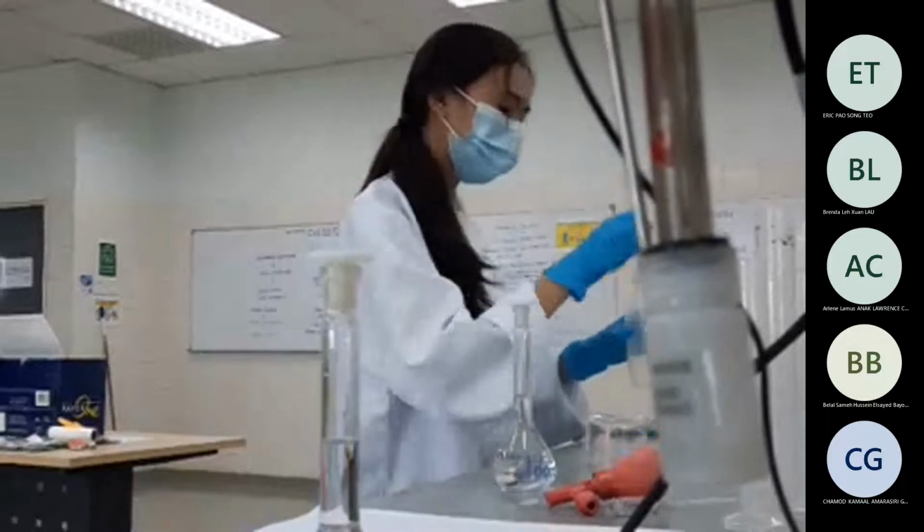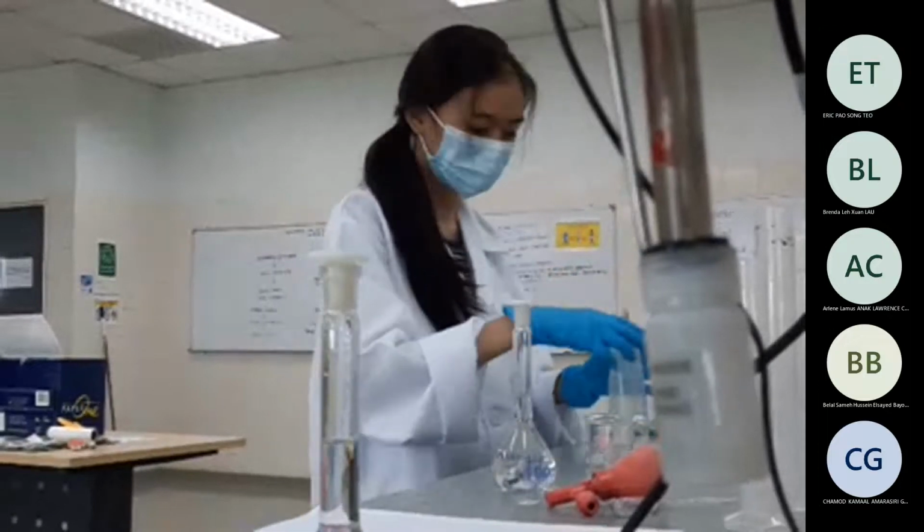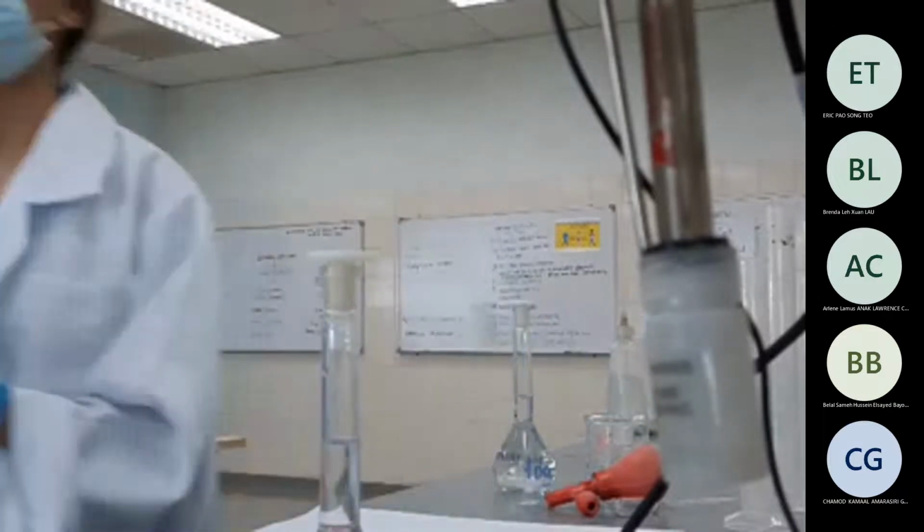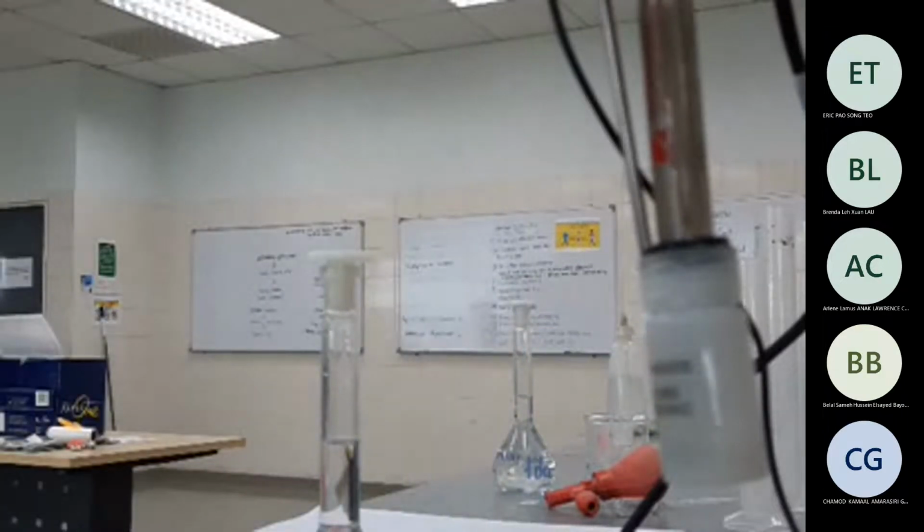So last time in high school, we don't actually have a waste bottle to pour away the hazardous waste. Yeah, because now for the hazardous waste, every year Swinburne needs to treat the water and it costs a lot. We cannot just discard it to the main source. We have to treat the water, and that's why we try to reduce it, because it's an environmental issue.